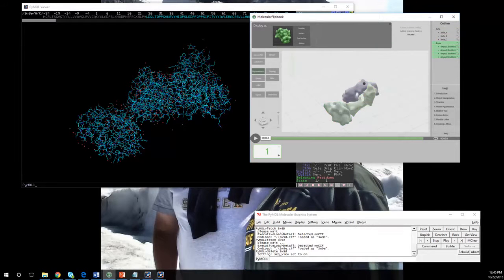So not to be distracting. So here's now the three models, and that's what this looks like. If I come into here and type in select, this is just so I name it, select GD, comma, I'm down at the bottom here. Select GD chain, and I think it was C. Yeah, it's chain C.